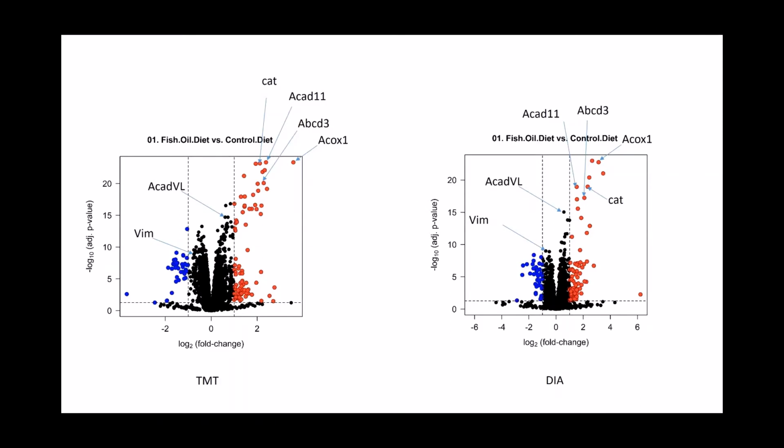Yeah, I think so. Because I think you're going to have more false hits with the TMT due to the batching effect and stuff. So that's where I went to this next slide here. You can actually see the full proteins from TMT versus DIA, and I tried to flag what proteins are the same in the two experiments and where they fall in the significance. The top abundant ones are all in the same kind of quadrant up here that I have highlighted.